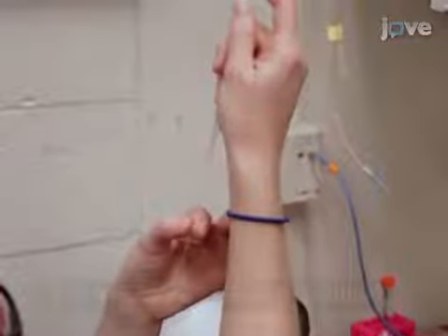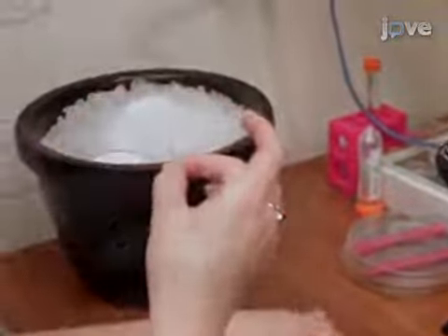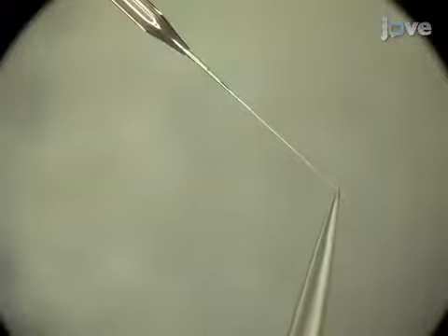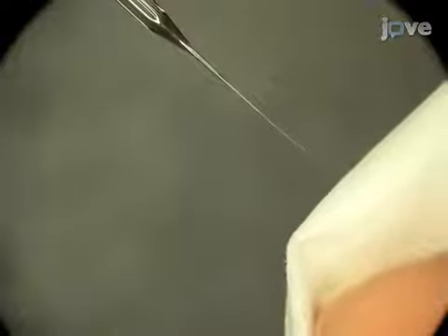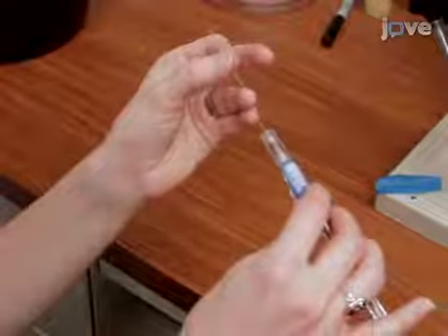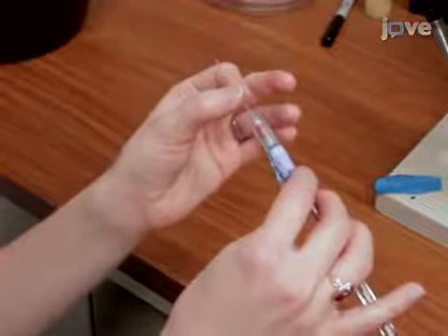Next, backfill the glass reference electrode with B&E solution and gently tap out any bubbles. Under the dissecting microscope, use the forceps to break off a small section of the tip. Subsequently, use capillary action to draw out any remaining bubbles with the tissue. Then, slide the B&E filled reference electrode over the wire of the electrode holder and be careful not to introduce any air bubbles.